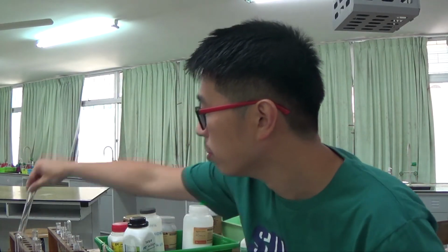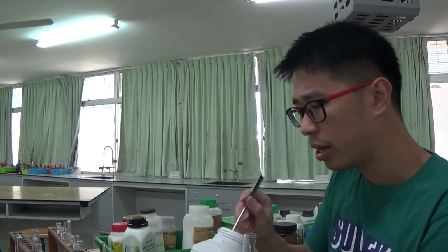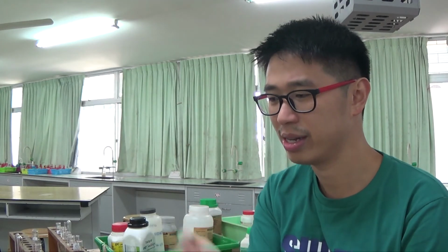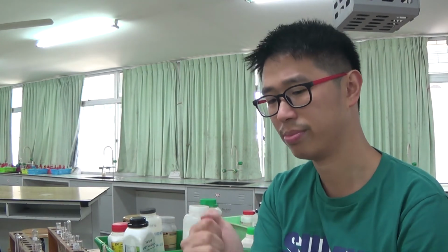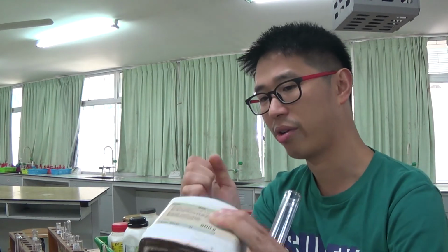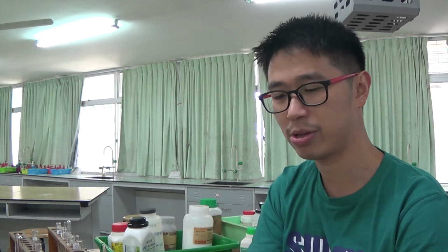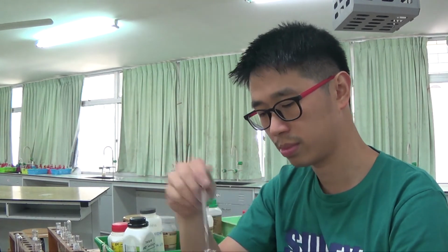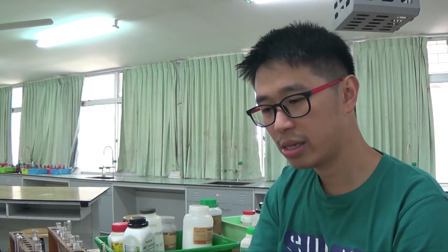Great, test tube. So this is not in the O-level syllabus actually, but you never know what will come out in the future. I know it is in the A-level paper 3. I think no one has used this solid for a long time. It's very, very hard. But I don't need a lot of it. I just need a small amount in order to show you what it is. It's manganese.